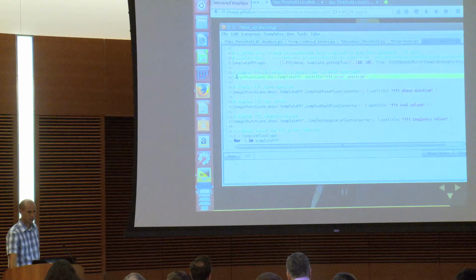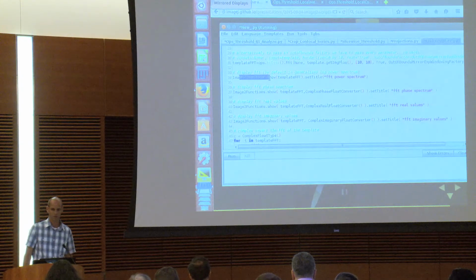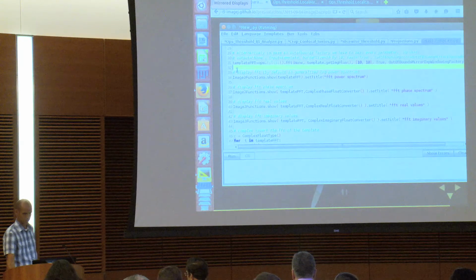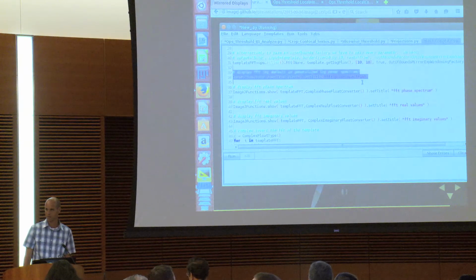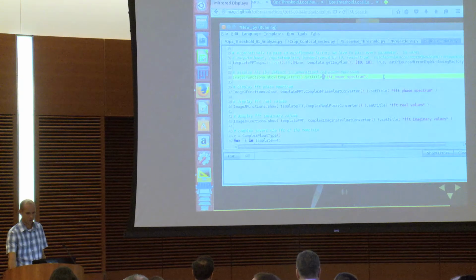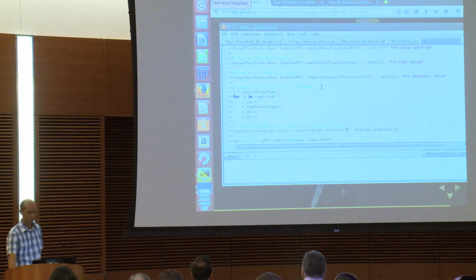Then there's a utility, I think it's an ImageLib2 utility as well, that allows us to visualize the results of the FFT. These FFTs are complex. Just to elaborate quickly, that function predates ImageJ2. It existed when ImageLib2 was just embedded inside ImageJ1, essentially. It was a little viewer. The reason we're still using it instead of the UI.show call that we're using everywhere else is that this thing is smarter about complex numbers. So this will show your phase, and you can look at your real and imaginary parts.